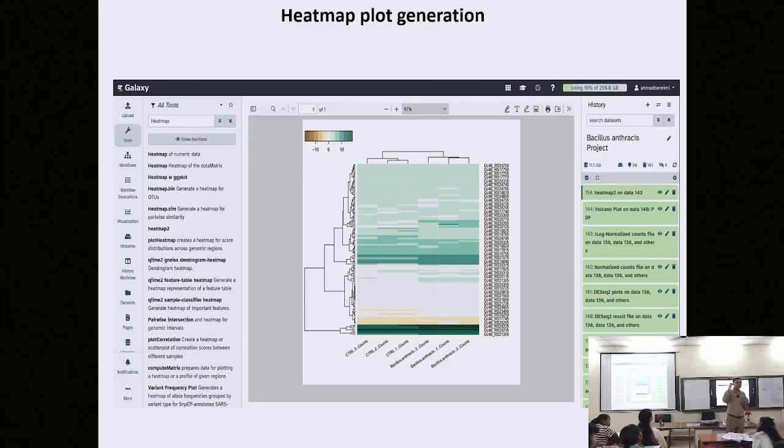So now you are looking above the gene, and that's important, because often genes do not work alone. They work together, they interact and confer a product or certain phenotype or some signal, right? So this way you can narrow down.